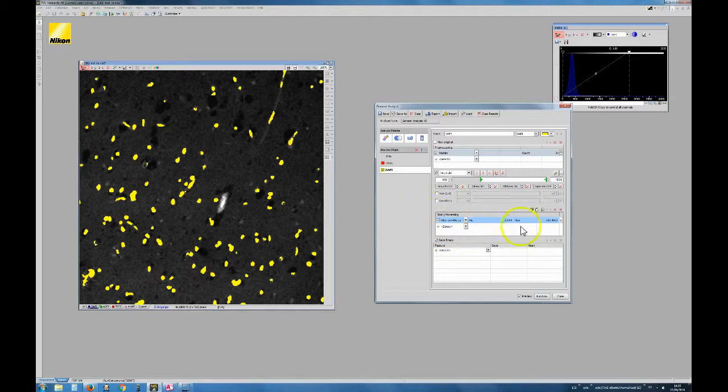So we've now done some processing of our binary. We've filtered out what we didn't want. And now we're going to decide what we're going to save. Maybe, for example, we could decide that we want to count the nuclei. There is some improvement possible. Some of them are fused or not. And again, you can toggle on and off to figure out if it's correct or not. Even though we've done some pre-processing, I want to mention that the final image that is interrogated is the one without the processing. So this is only here to help run the segmentation.